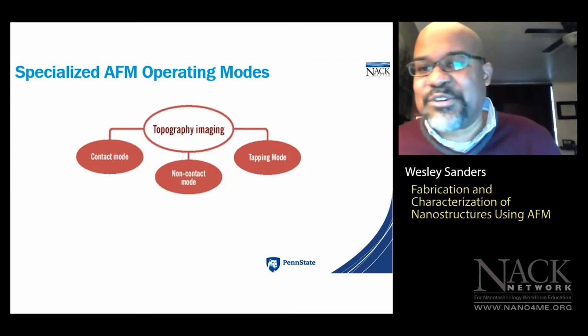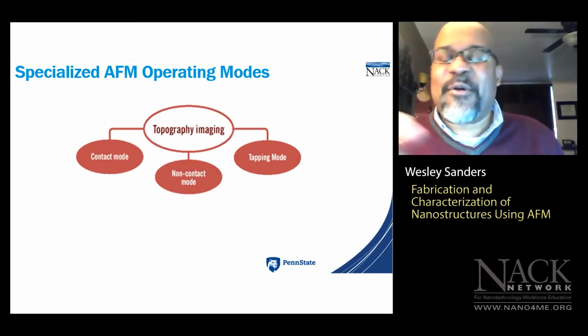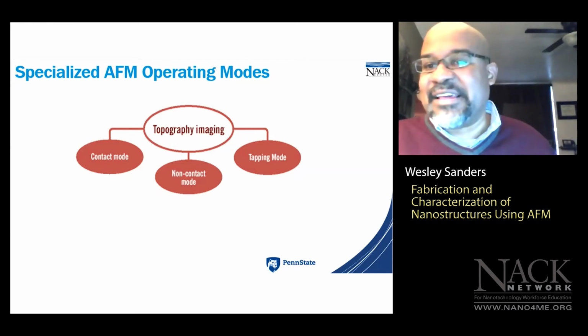Now, full disclosure, that's all I know about that technique. I don't know anything about the feature size that you can achieve using laser-induced desorption, but I do know that it's used to perform basically the exact same thing.